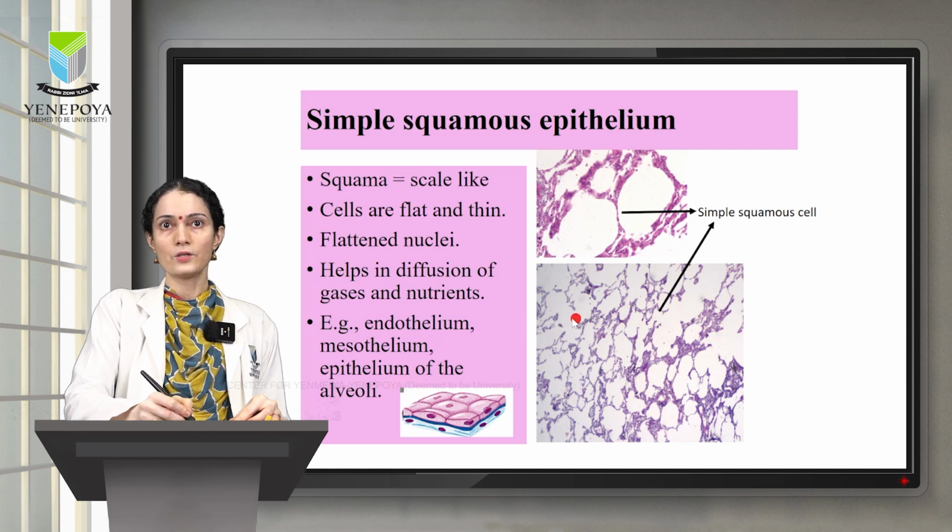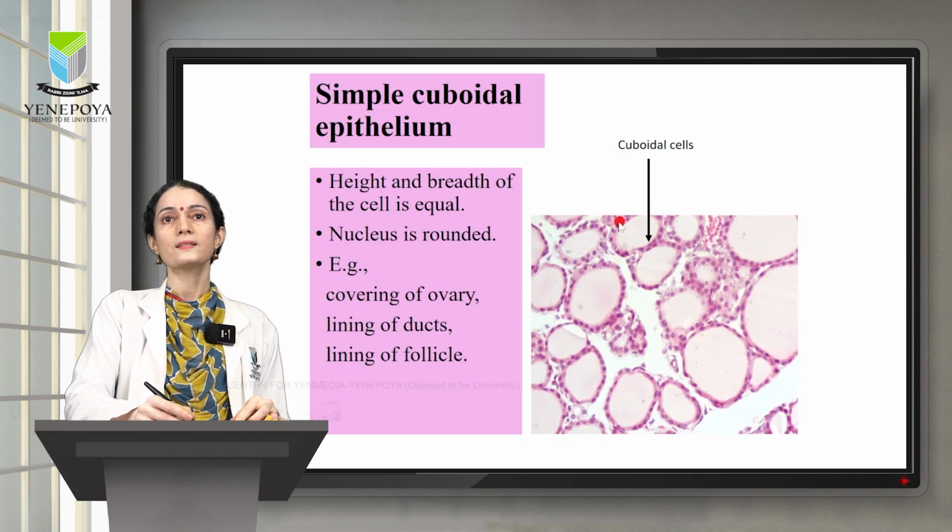So in this slide you can see the picture taken from the lung alveoli. Here you can see the simple squamous epithelia. Moving on to the next slide.